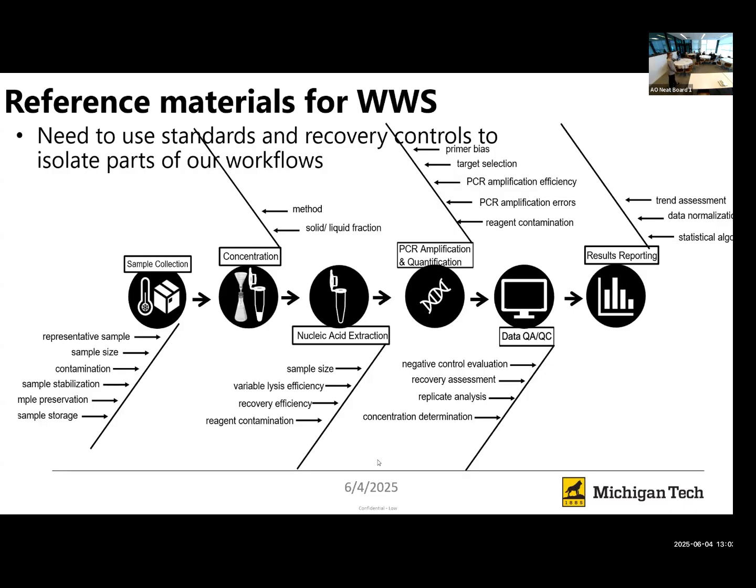Okay, so I'm gonna just give a little bit of an overview of kind of, you guys are probably in this room because you're interested in this and things that can impact your lab data. And so I, at Michigan Tech University now, I did my postdoc at NIST, the National Institute of Standards and Technology, and helped to lead the Standards for Wastewater Surveillance Working Group. And a part of what we thought about a lot at NIST and what I think about now in our lab is what impacts what we're going to quantify in wastewater. So what are the variables we're trying to assess? And then how can we account for those? And those are kind of two separate questions.